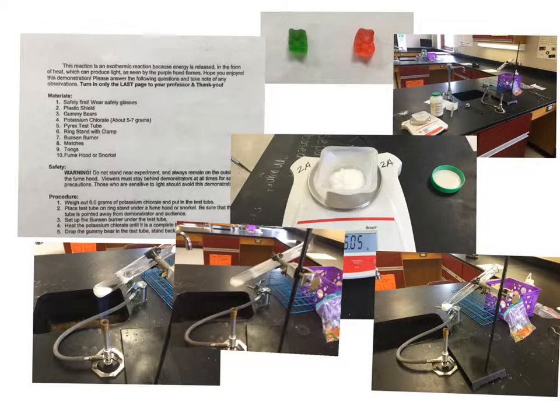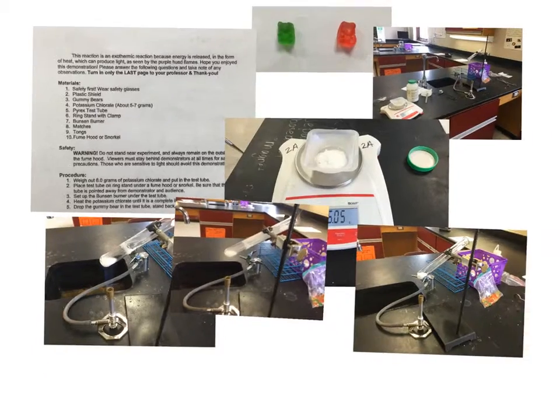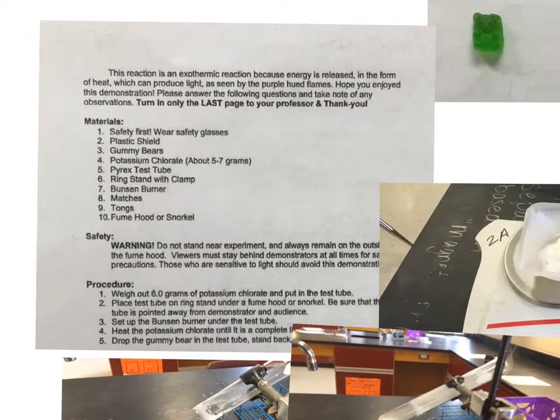Okay, if you open up your little booklet, you can see that you have your instructions right here. And it kind of tells you all of the little materials. One thing that I'm going to be doing different is instead of using the fume hood or the plastic shield, I do have it set up near the window so that it's properly ventilated and we are okay.